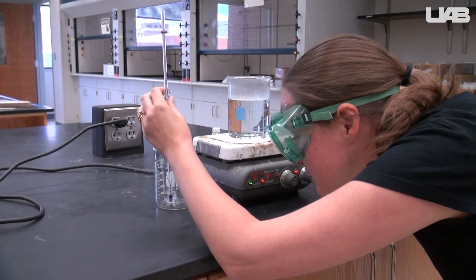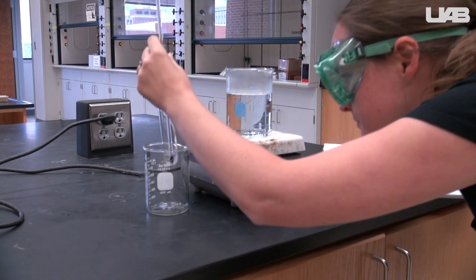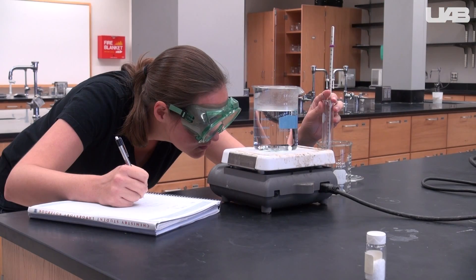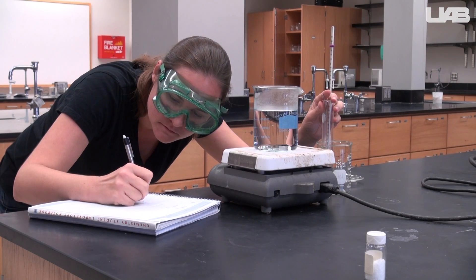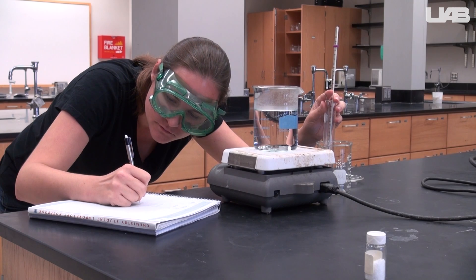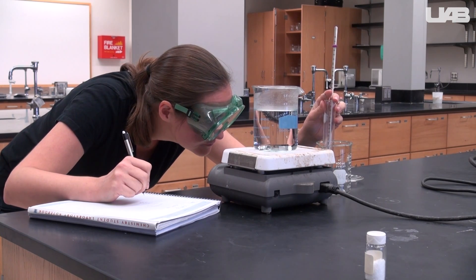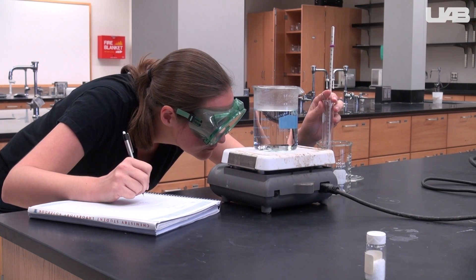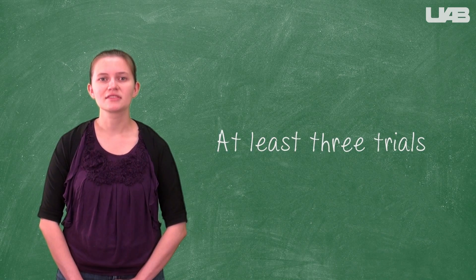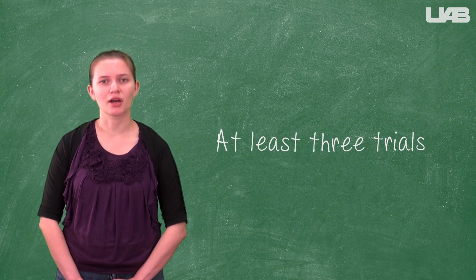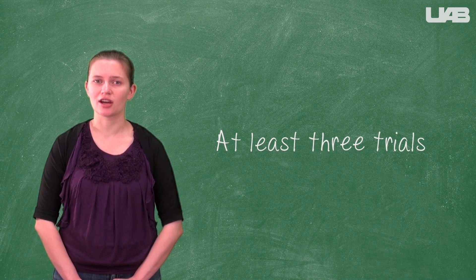Record the temperature every three seconds as you did for the pure solvent. When you see the first crystal form, record the temperature in your data table. Record the temperature two or three more times and see if it remains constant. You will repeat this heating and cooling process for a total of at least three trials.